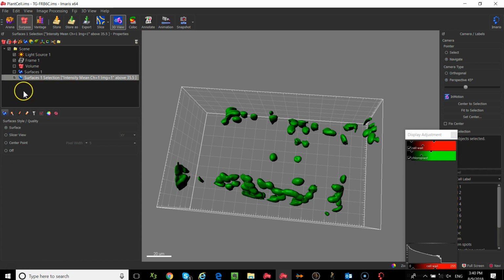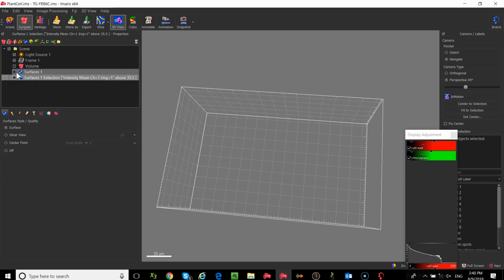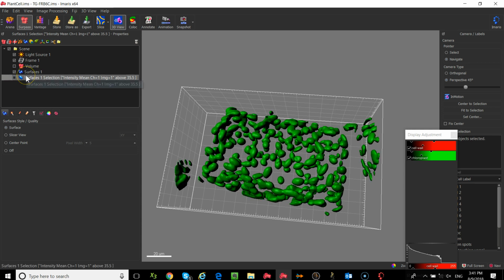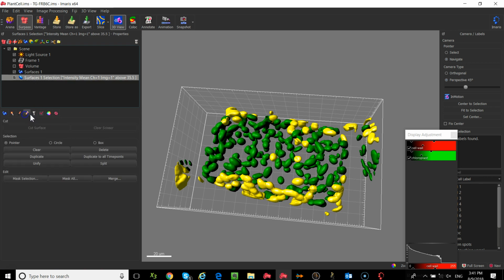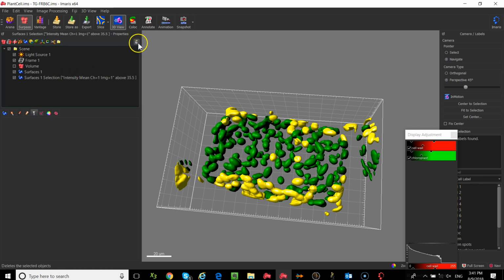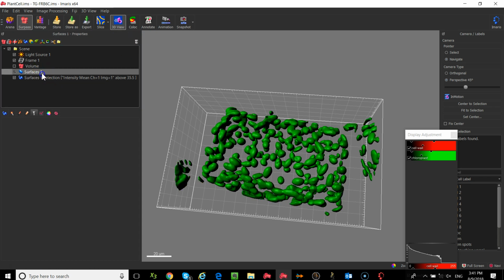Okay. Incidentally, if you were filtering with the purpose of getting rid of something, you could do the same thing. So if I go back into the filter tab, my filter tab is not behaving. Okay, I'll do it in this one. Neither of my filter tabs are behaving. Darn it. Okay, I'm going to walk you through this. Hopefully it's working for you.